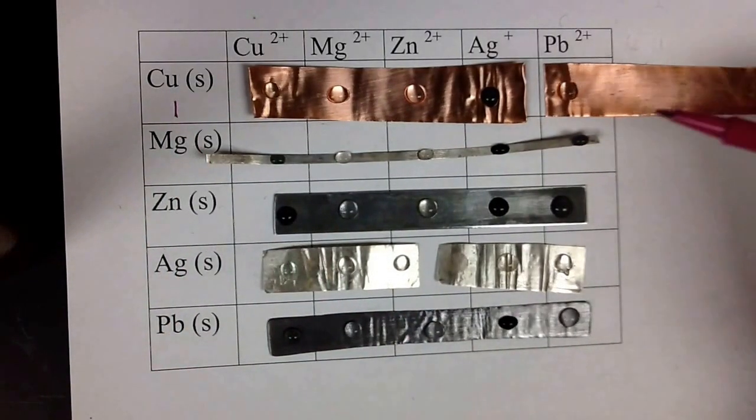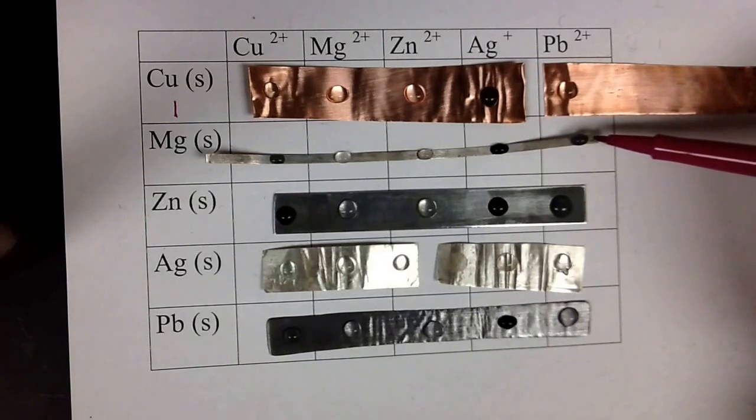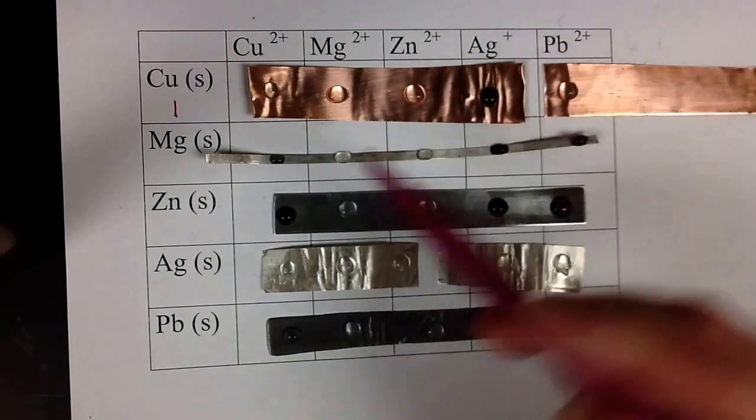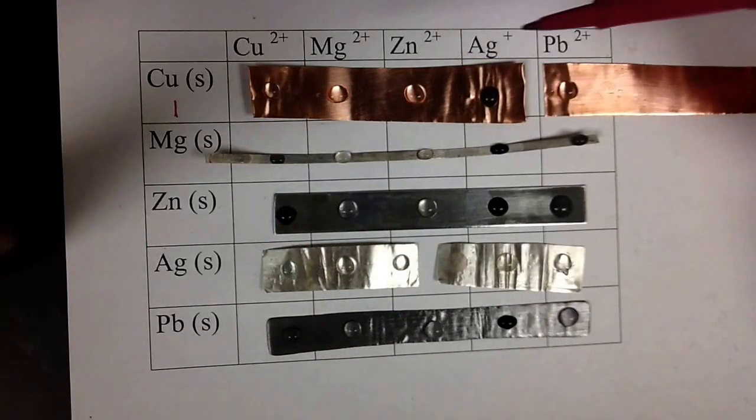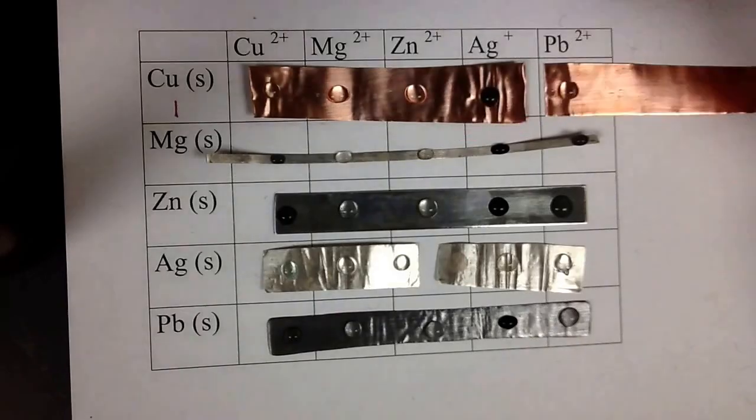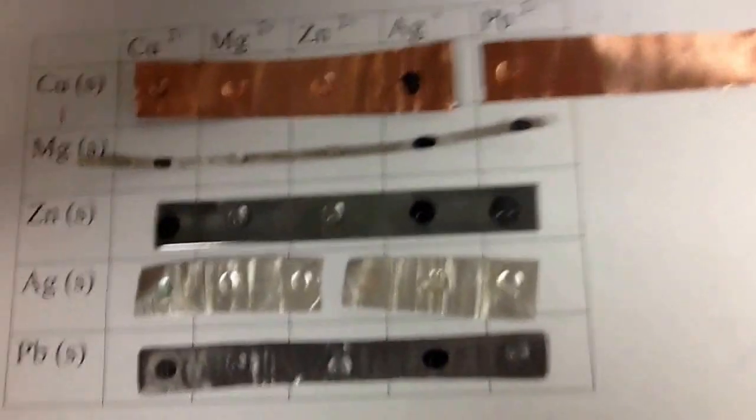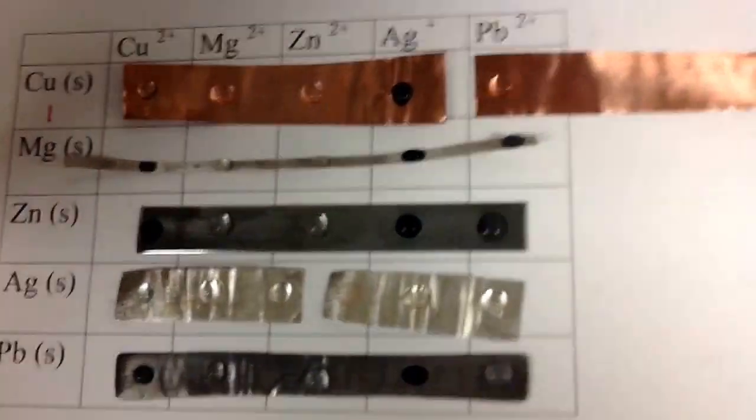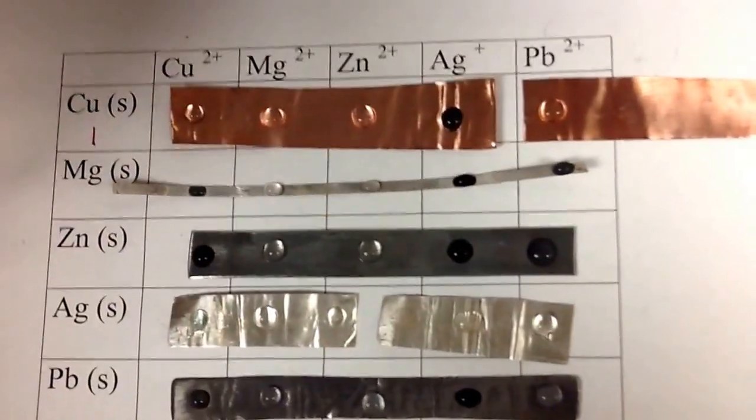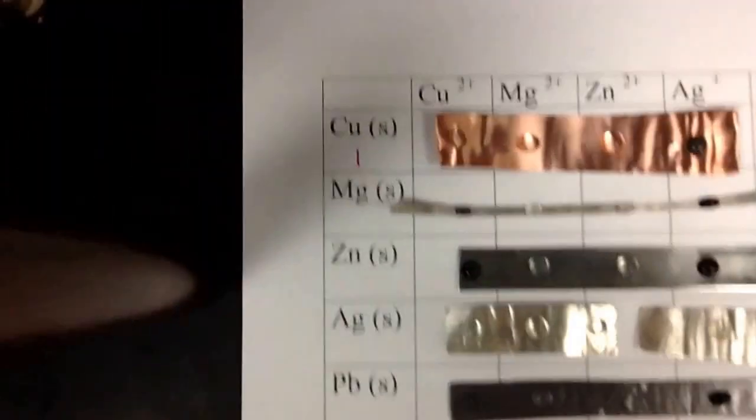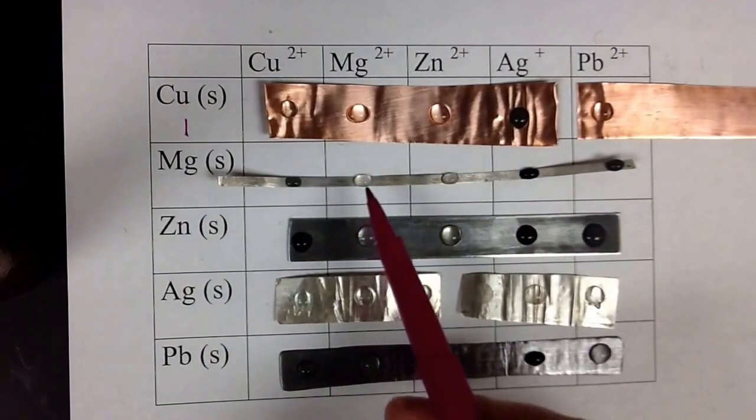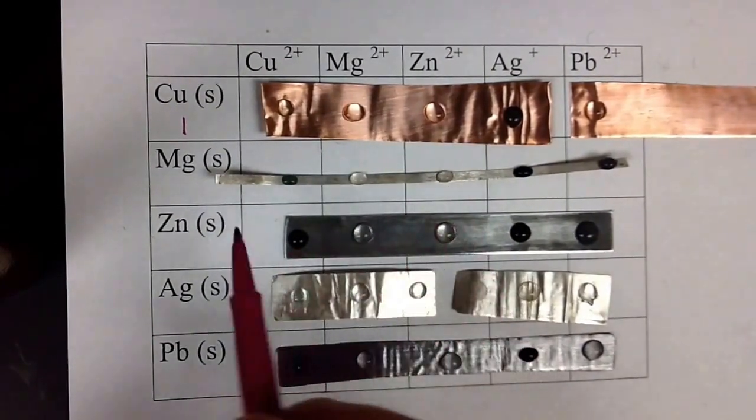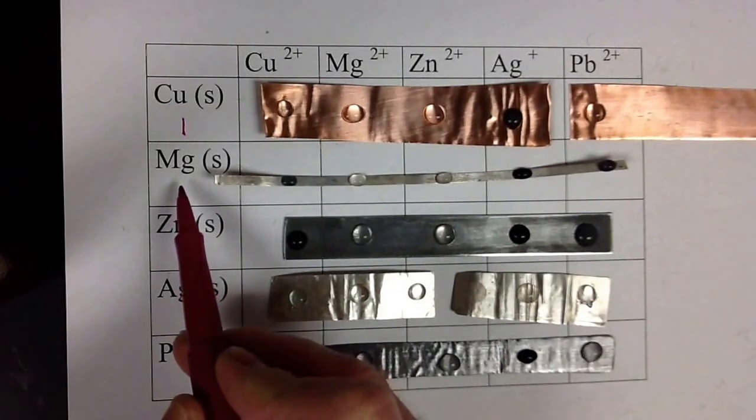For magnesium, we can see reaction here. It's turning here, and three right there. And I'm going to see if I can kind of zoom in. I believe there's a reaction here, but it's just forming some bubbles. Let's see if we can zoom in a little bit. That's not letting me here. But I think there is a reaction there. And it's just a little bit harder to see. You may notice this may seem a little more clearly, but I think we should have all four reactions there.